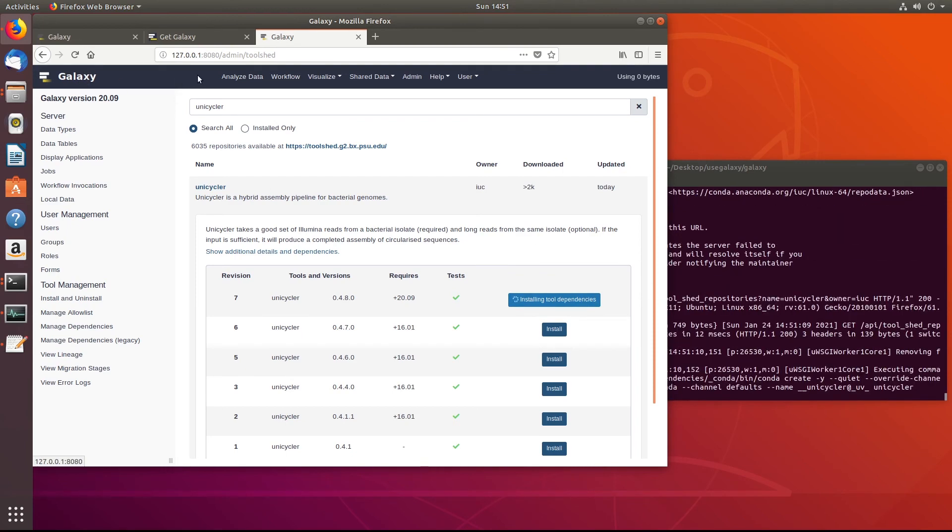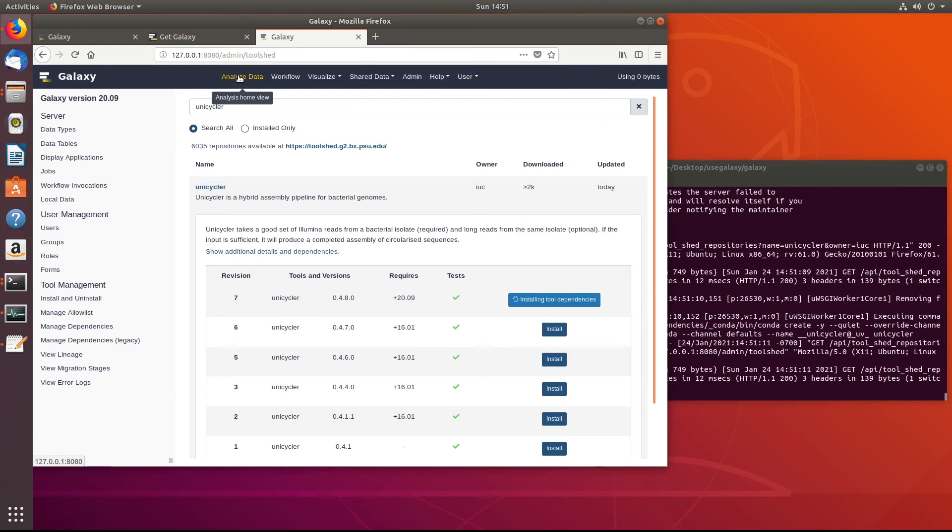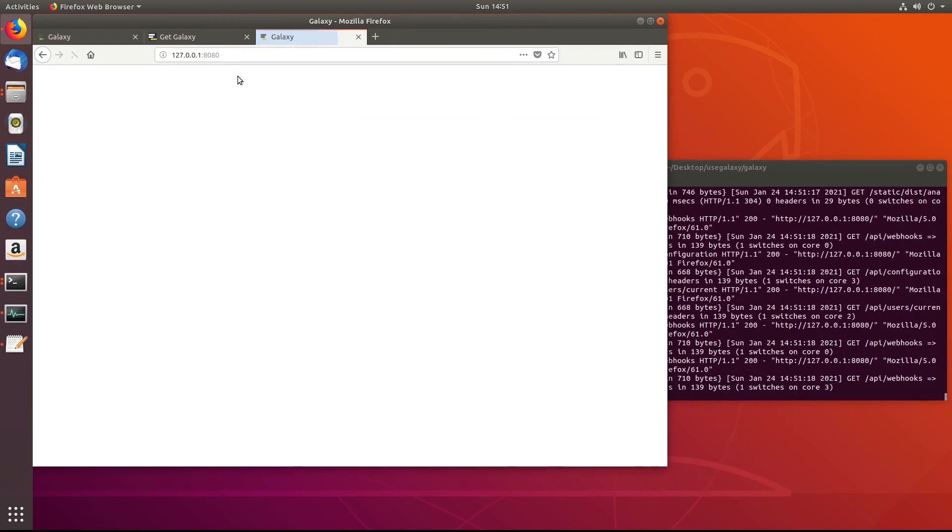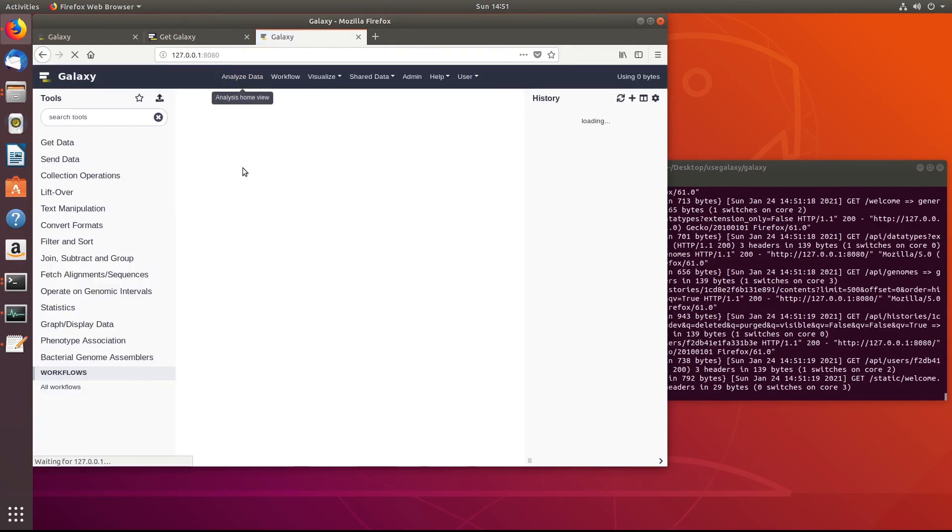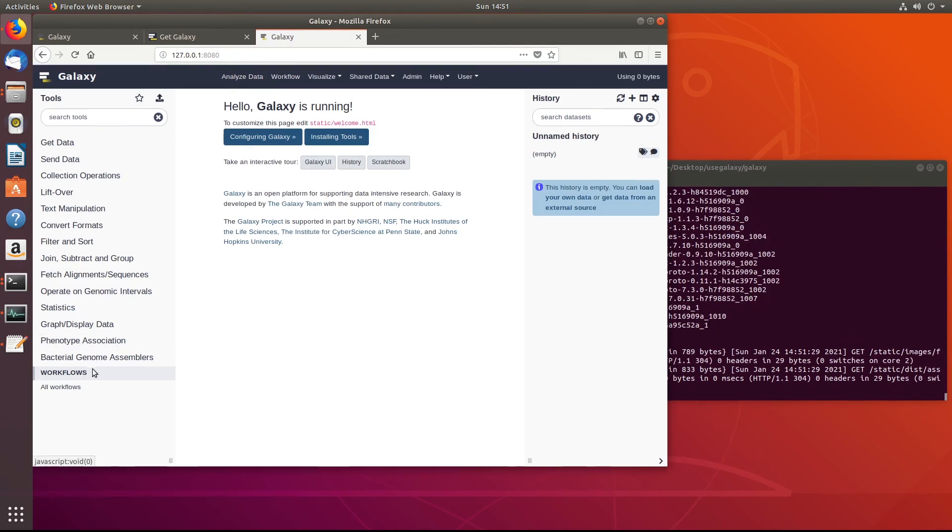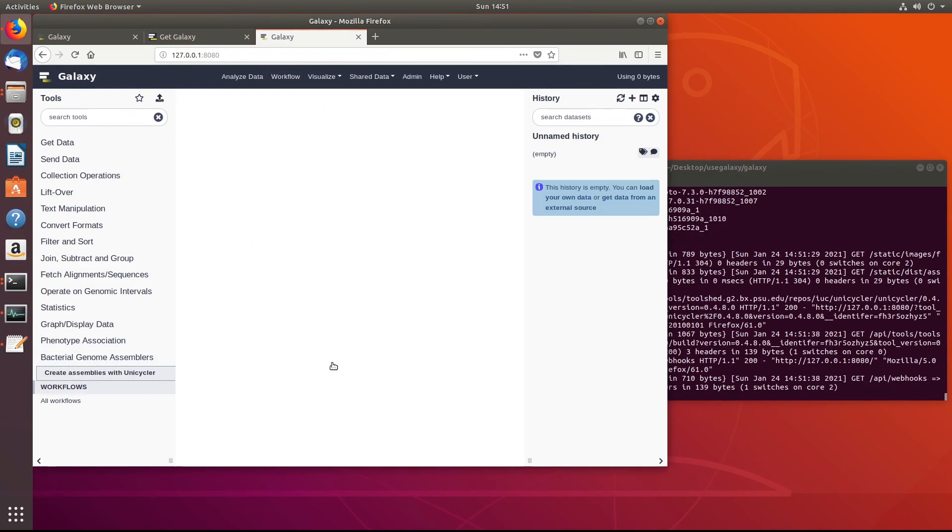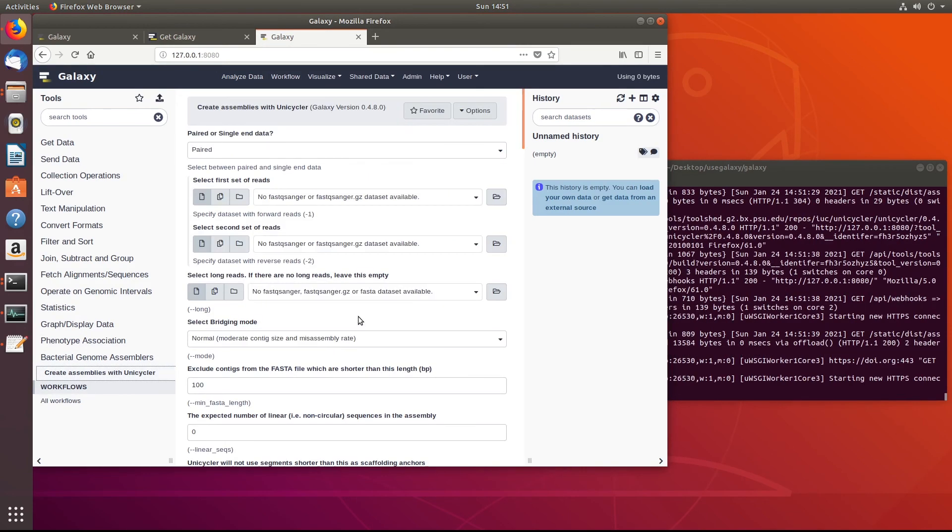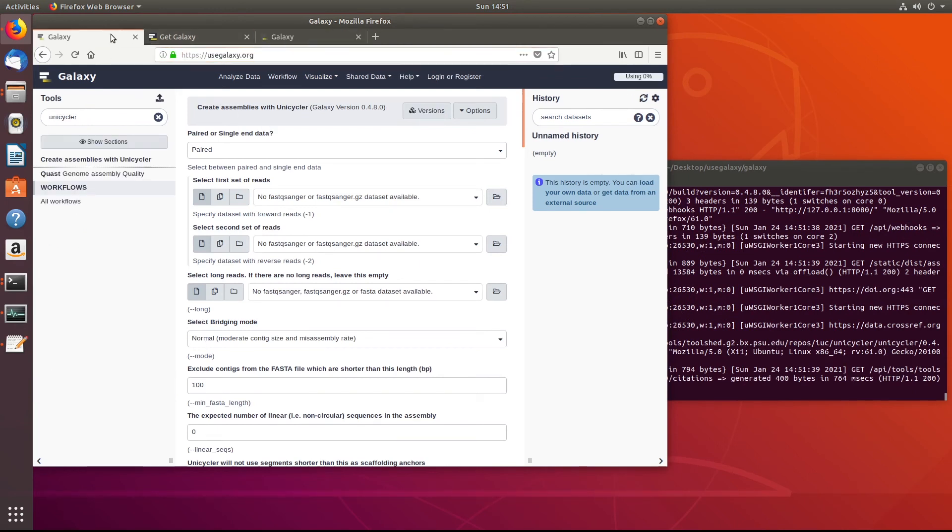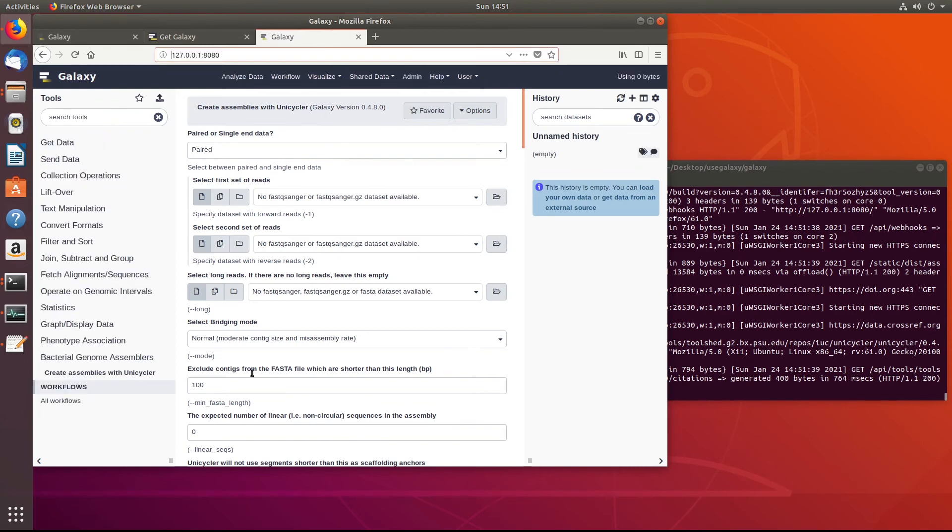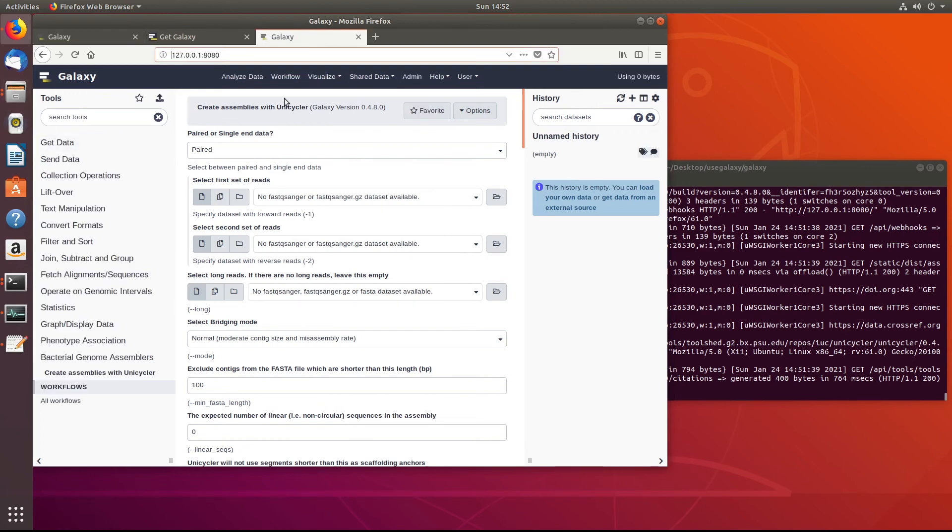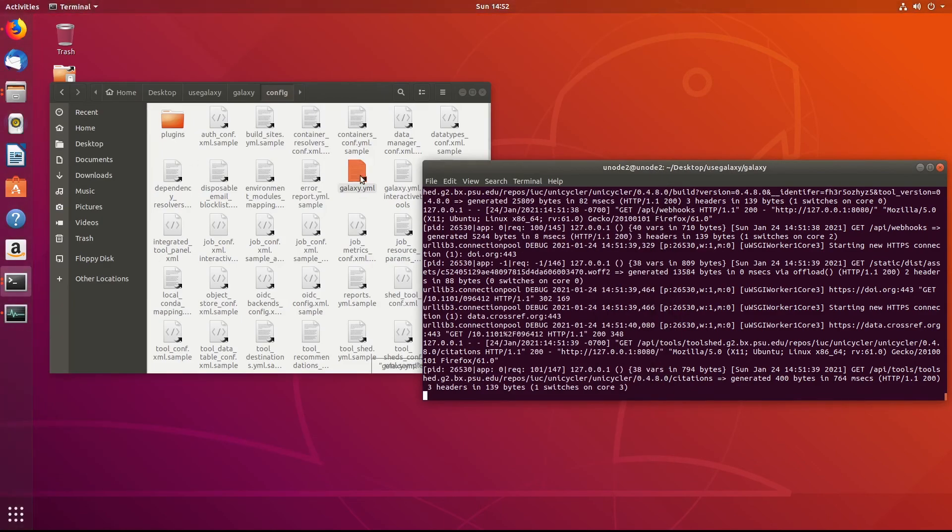And if we go back to the analyze data page, we should see a new folder called assemblers. And we'll head back there. Bacterial genome assemblers. Create assemblies with unicycler. So here now locally, so on our local machine, we have the same thing that is on the useGalaxy website. So now we can run this assembler locally and we don't have to compete for resources with other people who are also wanting to use the Galaxy interface here.